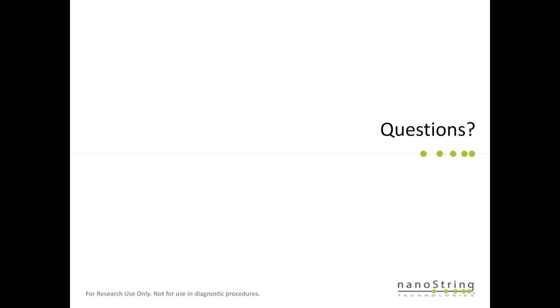So if you compare three things: CFU, histochemistry, where you get some tissue, stain it and count the number of cells, which is again another golden standard, and also the NanoString quantitation. It actually turned out that the NanoString quantitation correlates with the histochemistry, especially in the case of filamentous fungi, where CFU number is hard to get because of the way the cells grew, and in a biofilm one CFU does not necessarily mean one cell.